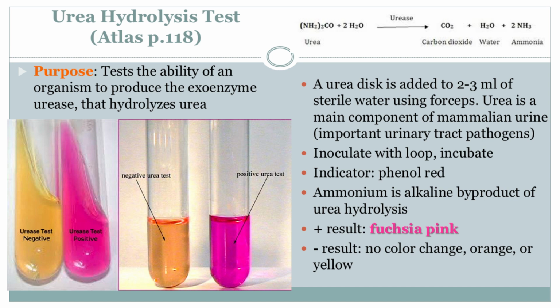Wow, that's pretty dramatic. It's a clear sign that urease is present and active. So we're essentially looking for a color-changing magic trick to tell us about these bacteria. It's like a visual alert system. It's incredible how such a simple change can reveal so much about what's happening at a microscopic level. It really is. But this color change, it's not just a cool visual, right? What does it actually mean for, say, identifying bacteria and treating infections?